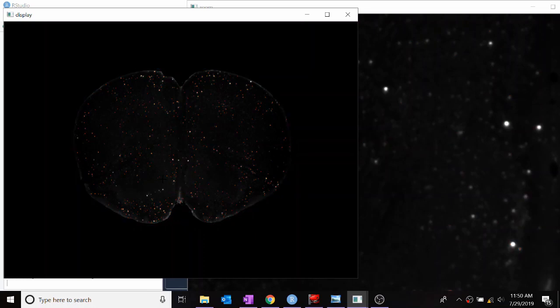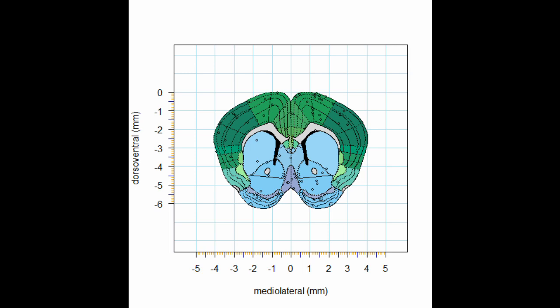And it can also segment features of interest in these images and warp them back onto the atlas space. Because WholeBrain has really minimal processing requirements and it's open source, it's a really great resource for people who are interested in brain mapping projects in mice.